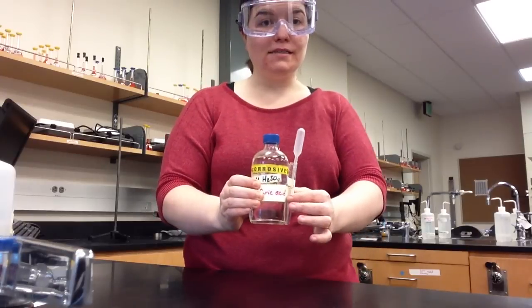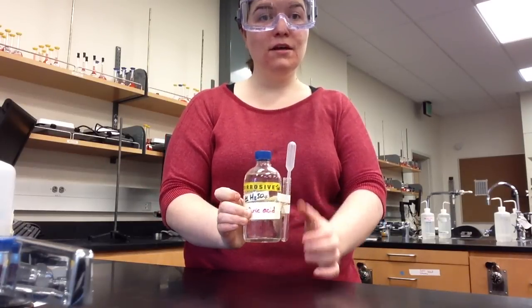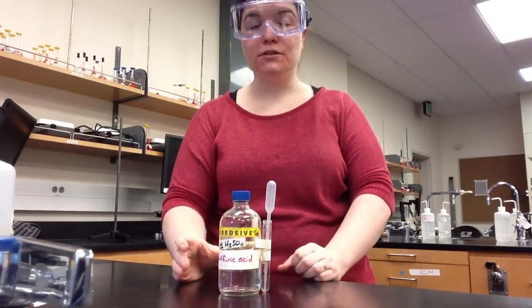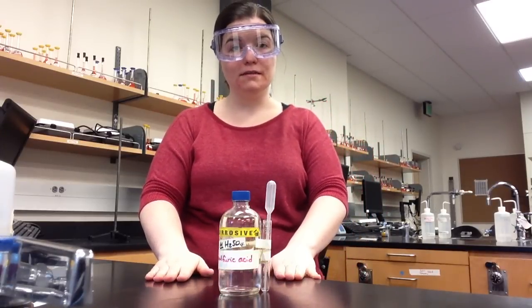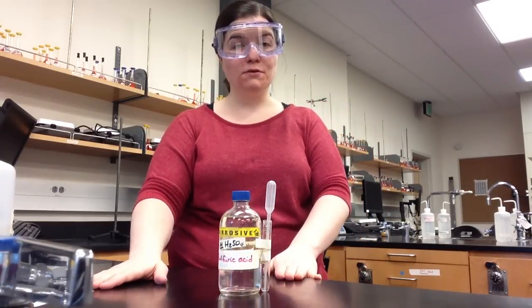In addition to Bunsen burners today, we'll be using corrosive chemicals. We'll be using sulfuric acid. Corrosive chemicals can cause damage to your skin if they come in contact with your skin. You should be very careful with corrosive chemicals.